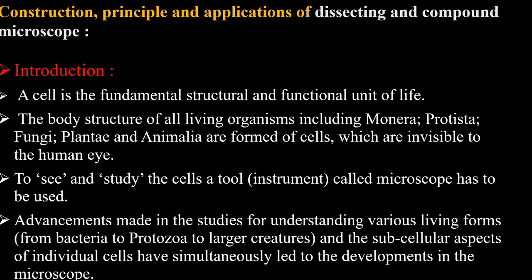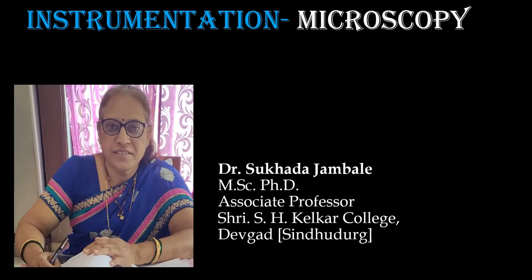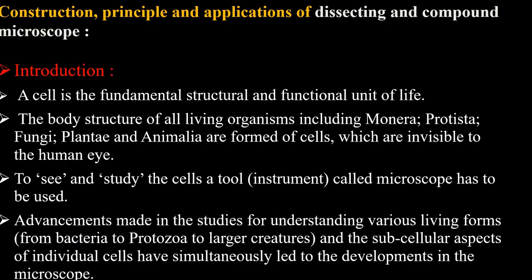This is our second lecture on the unit Instrumentation from the paper second, and this lecture is on microscopy. We'll start in this lecture with the description of dissecting microscope and compound microscope. The points to be considered in this lecture are construction, then principle and application of dissecting and compound microscope. First, we'll consider the first point, that is introduction.